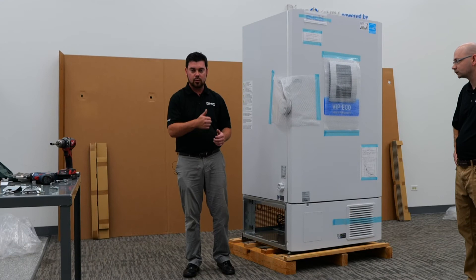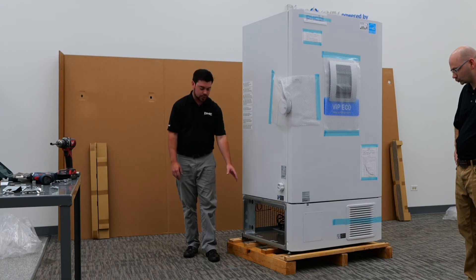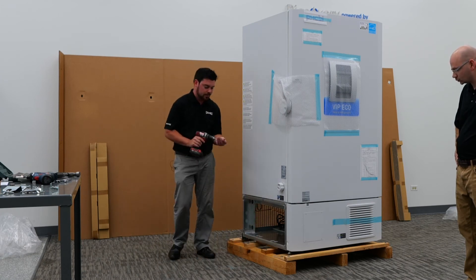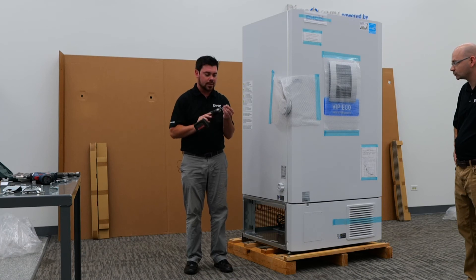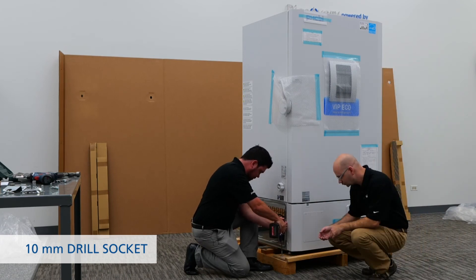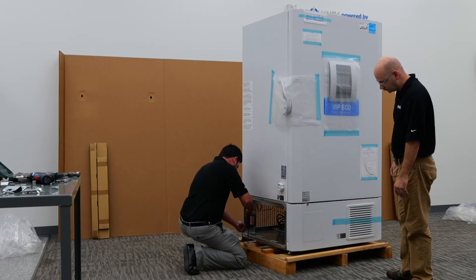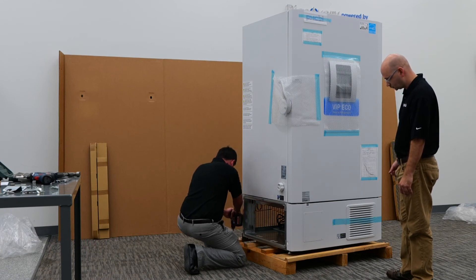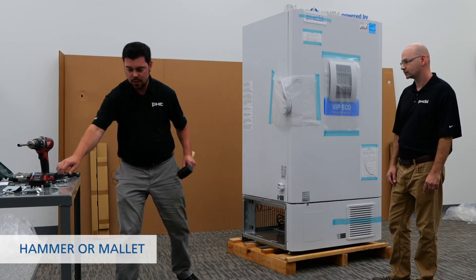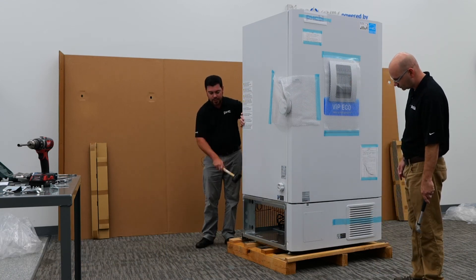Now that the leveling feet have been raised up and we have the unit spun around, we're going to come to this left hand side and remove the five skid hardware screws using a 10mm socket. This will allow us to knock this portion of the skid off, creating a ramp. We'll take a mallet and a hammer and wedge that support piece directly outwards.